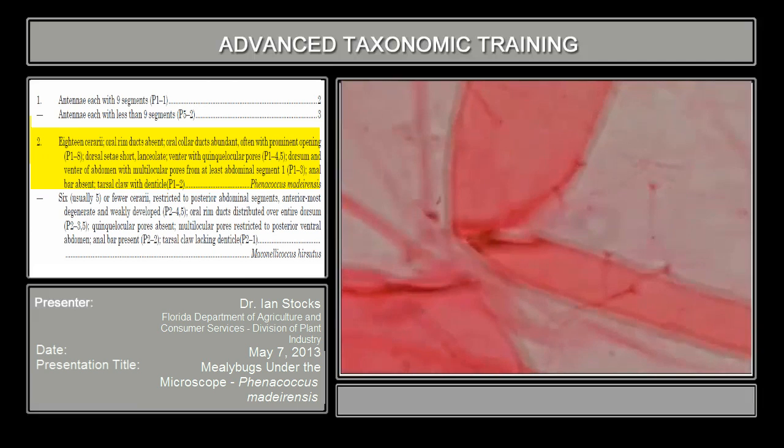One of the things that I try to use if I'm having trouble finding the denticle, and I think it's supposed to be there, is, if you've got around 400x, which is the least you're going to need in order to really properly discern it, kind of focus in and out on the edge of that claw. You're less likely to see the actual structure than changes in the light quality where the denticle is, because the light's going to be bouncing off of it a little bit, and it's going to change the light a little bit. So you may not see the structure, but you'll see that there might be changes in the way the light's behaving. It's a kind of color difference.